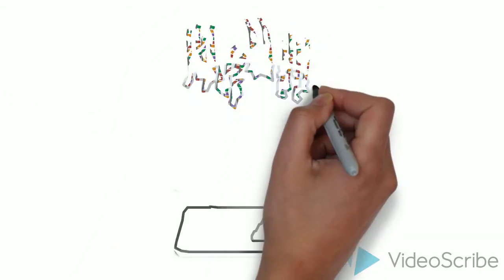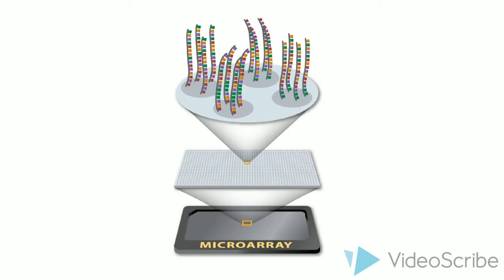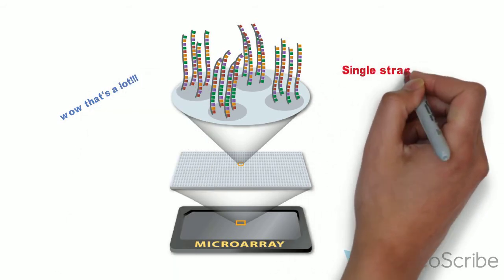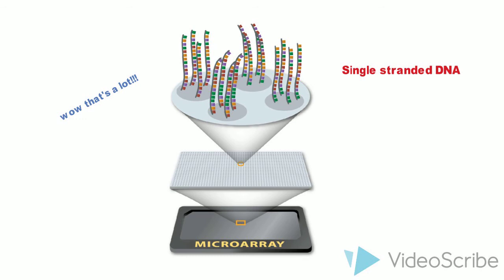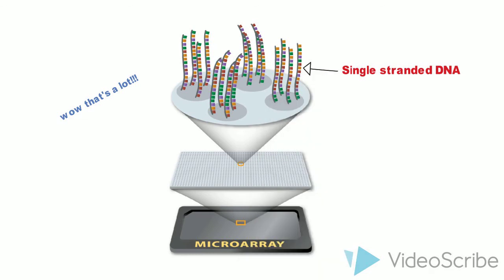Of course, DNA microarray analysis would not be possible without the DNA microarray itself, which consists of as many as 1 million different single-stranded DNA segments that are permanently attached at one end to a glass slide or silicon chip. Each DNA sequence is linked to the slide or chip in a known location and serves as a probe for a specific transcript. In other words, each one of the thousands of spots in a DNA microarray contains single-stranded DNA from a unique exon found in the genome of interest.